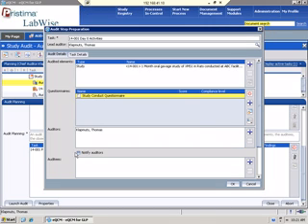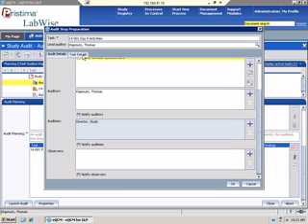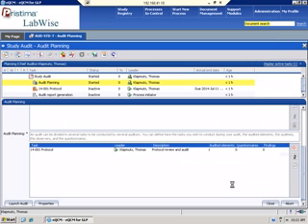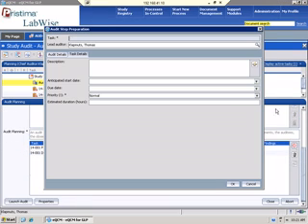Okay. Again, the same auditor. We'll pick the auditee. Task details. So this we're going to do today, due by tomorrow. Now I have my protocol, my day 0 activities. So we'll back up to, we're going to do data tables and the report. And so you can just build your activities.